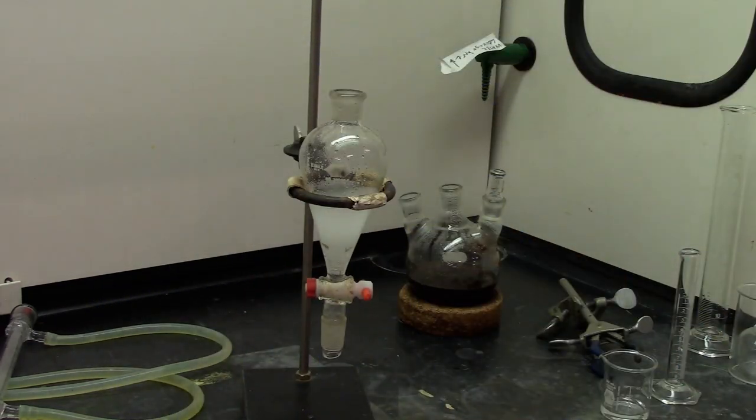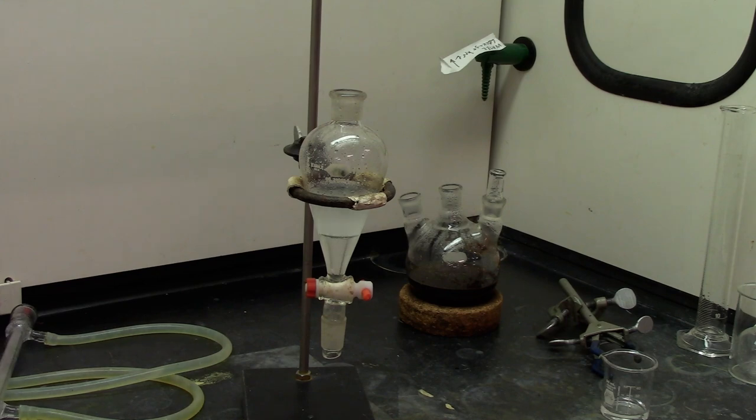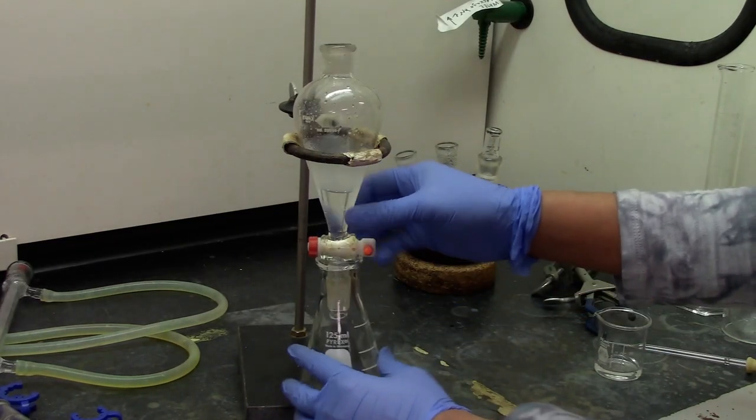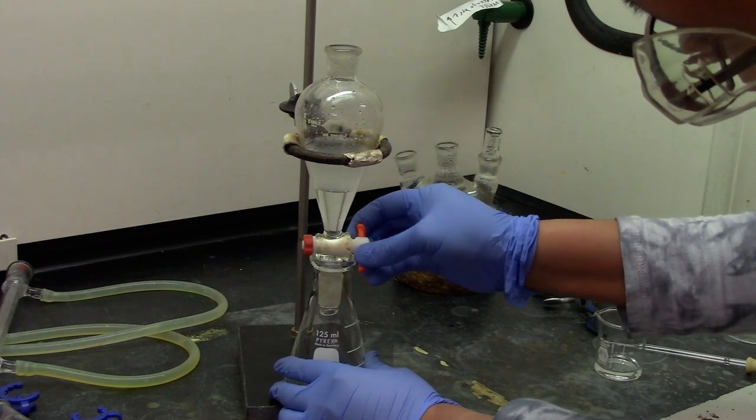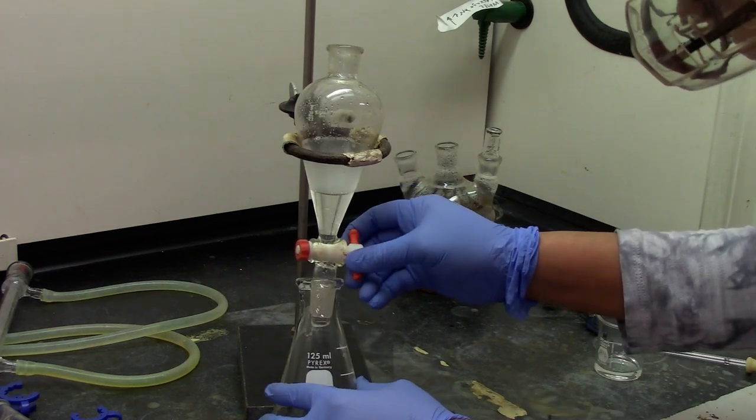Uncap the separatory funnel and let the two layers separate. Once the two layers separate, collect the bottom layer into a clean, dry, unmeted flask.